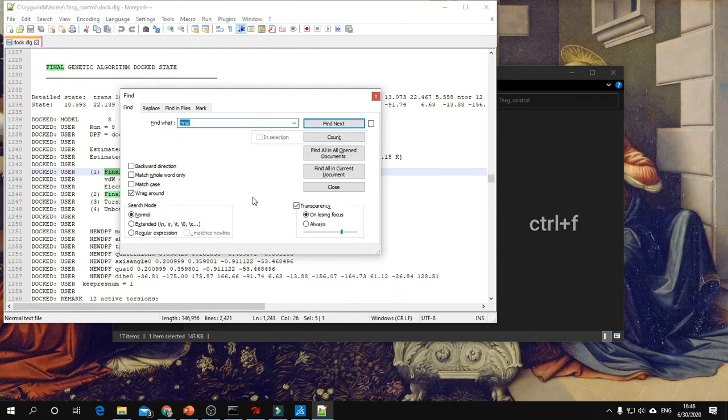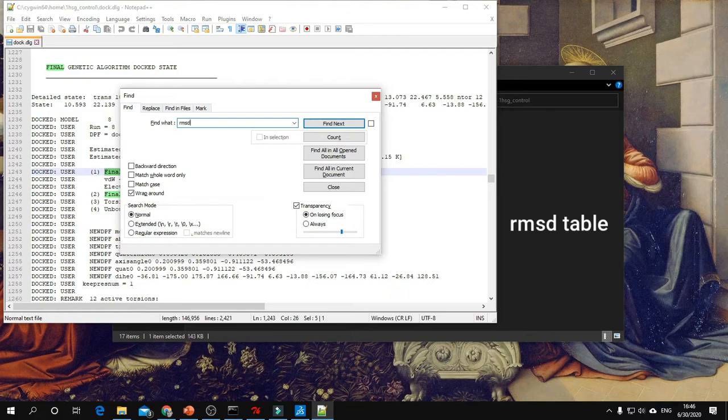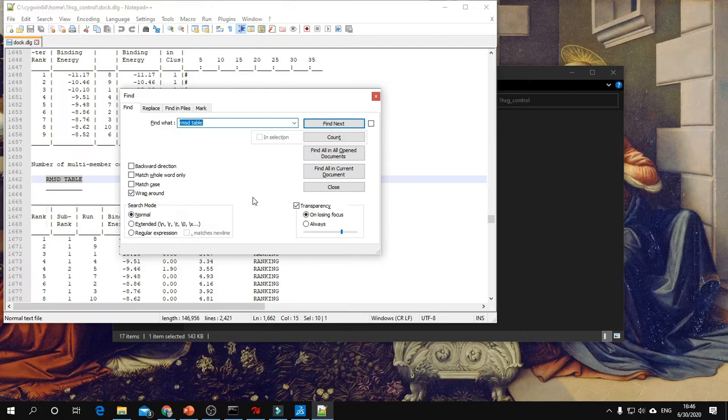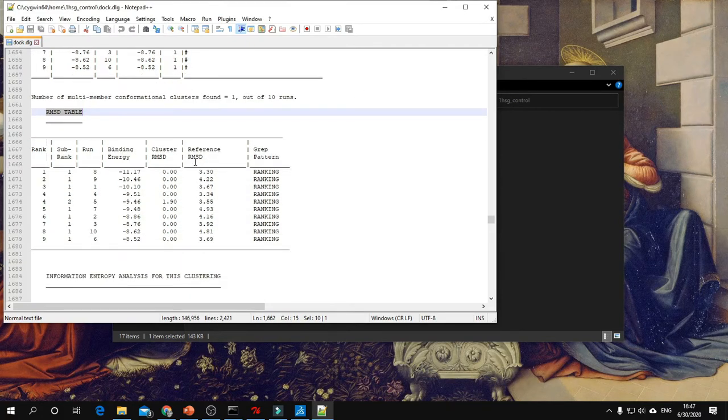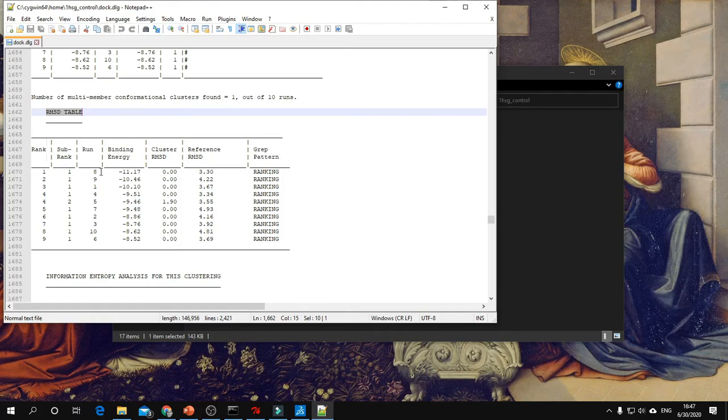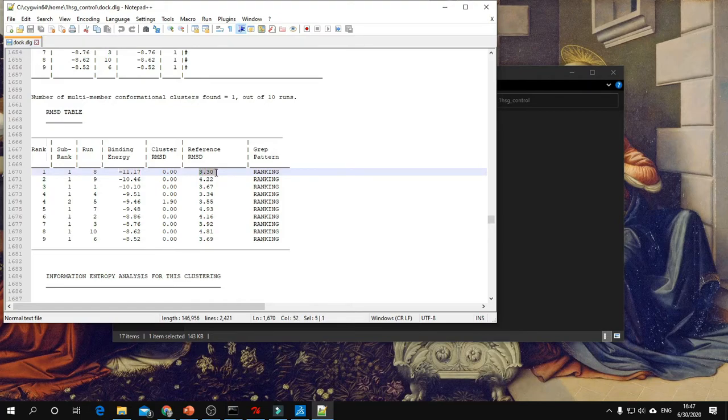Type RMSD table. Within this RMSD table you can find run number 8, the binding energy again, and the RMSD value.